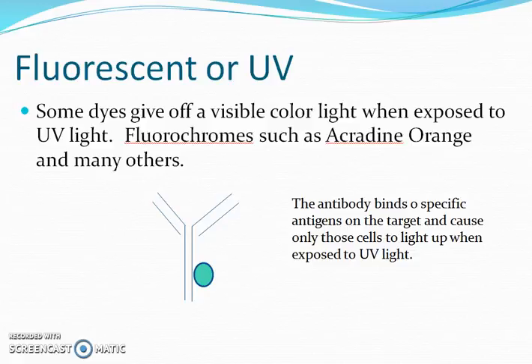One really cool and powerful microscope is using fluorescence microscopy, which uses fluorochromes or fluorescent molecules. When you hit these molecules with UV light, they give off a different color. So if you're using acridine orange, you hit it with UV light, it may give off, I can't remember if it's a blue or green color, but it gives off a different color range. So if the dye will stick to certain kinds of bacteria or certain molecules, then you can look for that.